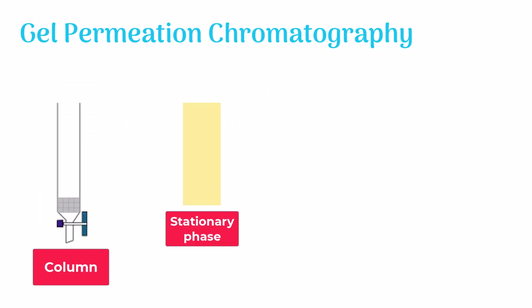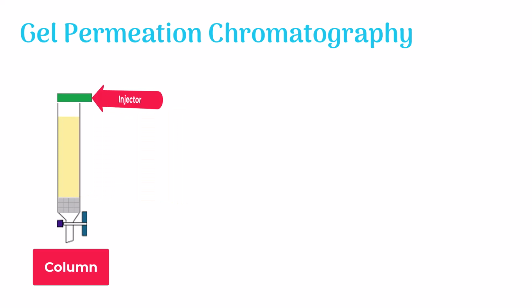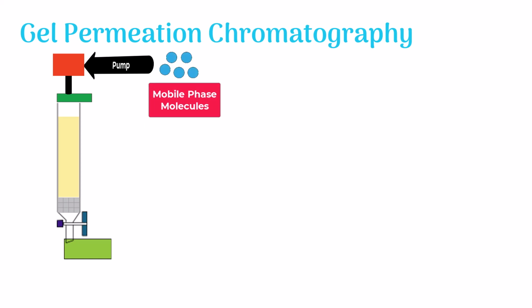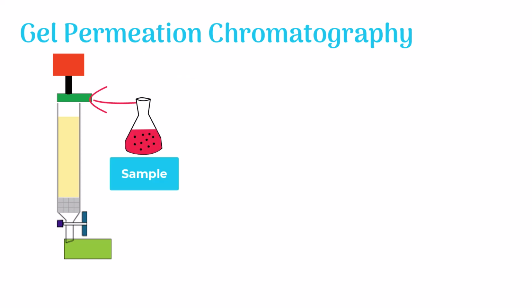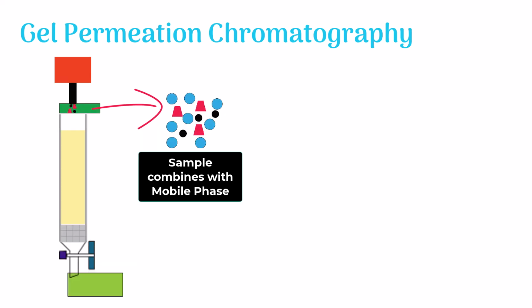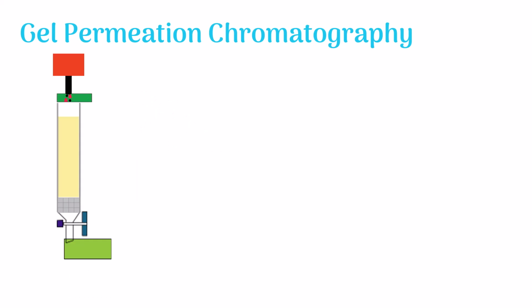First, the stationary phase is packed inside the column. The column is in contact with the injector and a pump. At the end of the column, there is a detector attached which detects the escaping molecules. The pump continuously pumps the mobile phase towards the column. The sample is injected inside the injector. The injector is the spot where the sample combines with the mobile phase and moves toward the column.